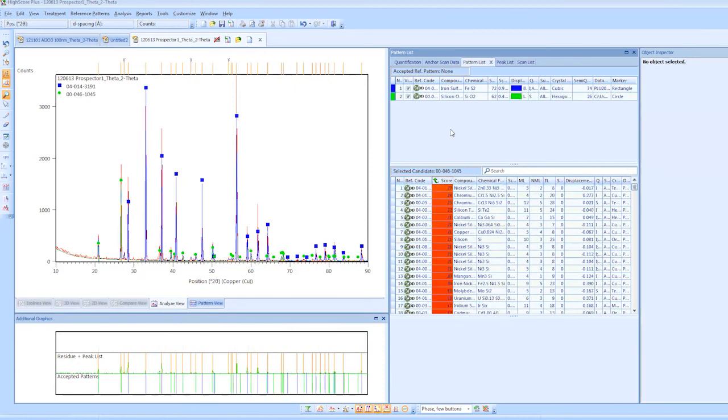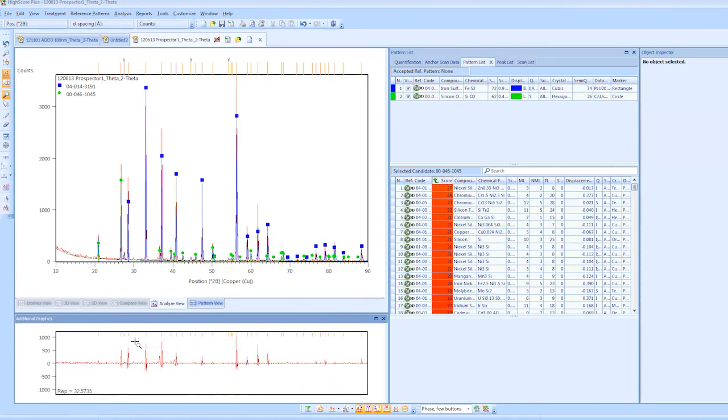And that one's not even the one that I picked before, but it actually matches most of the lines. Okay, so now let's go back. So see this difference plot? It's 32.57. I'm going to go back and redo this, and we're going to do this with a smooth.